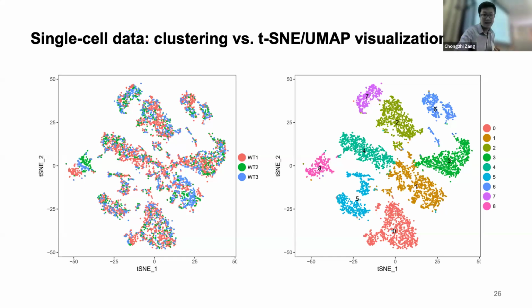That is why in some cases you can observe that cells on the UMAP, although they are together, are not necessarily sharing the same color, because the color clustering information is from a different set of data. Not different, but the original data set.